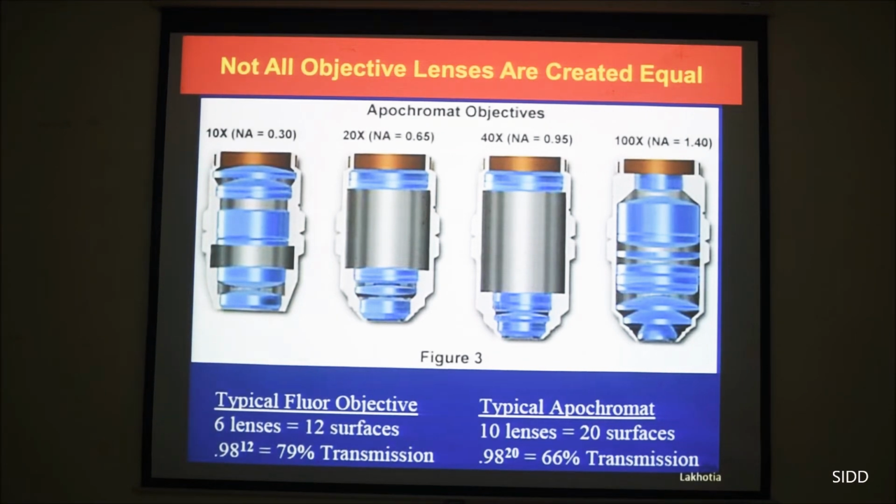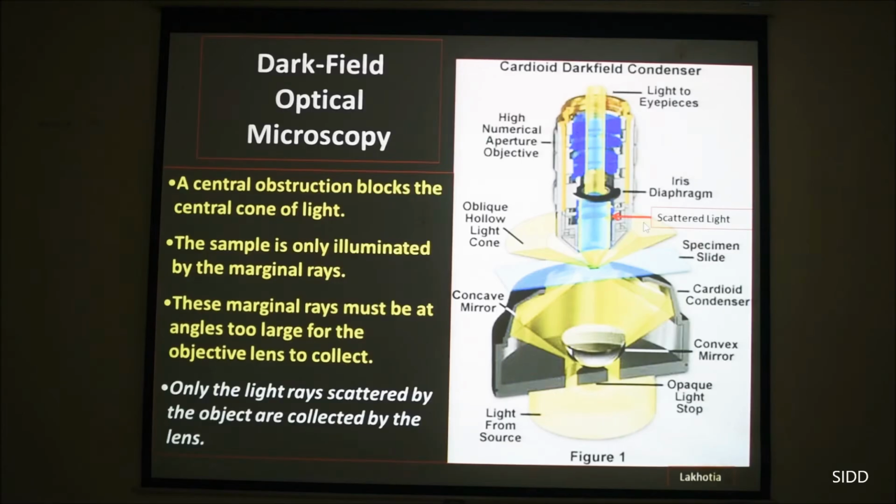These are not something that, okay, you can get it repaired or it's just to be thrown. And partly because these are very precisely crafted, made in a precise manner. I mean, imagine if 0.1 micrometer difference between these two lenses and that's gone. They have a special cement between them, and so they have to be extremely carefully handled.